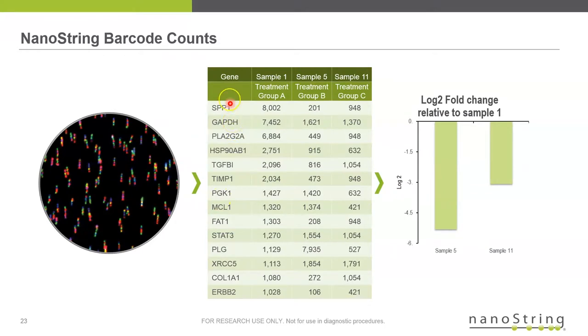And ultimately what you get is all the different analytes you're measuring, all the different samples or regions of interest, and then the digital counts, how many times that particular molecule or that particular UV cleavable tag was present in that sample. So it's a direct quantitation.